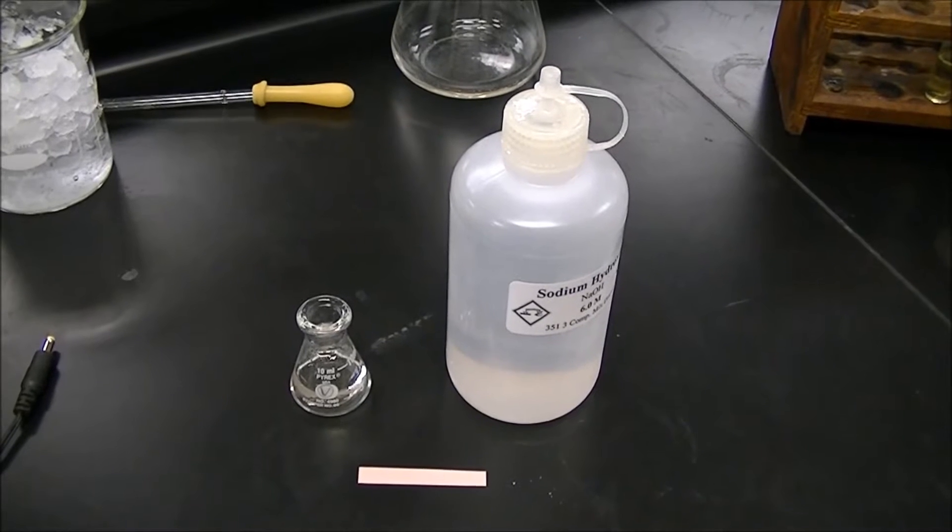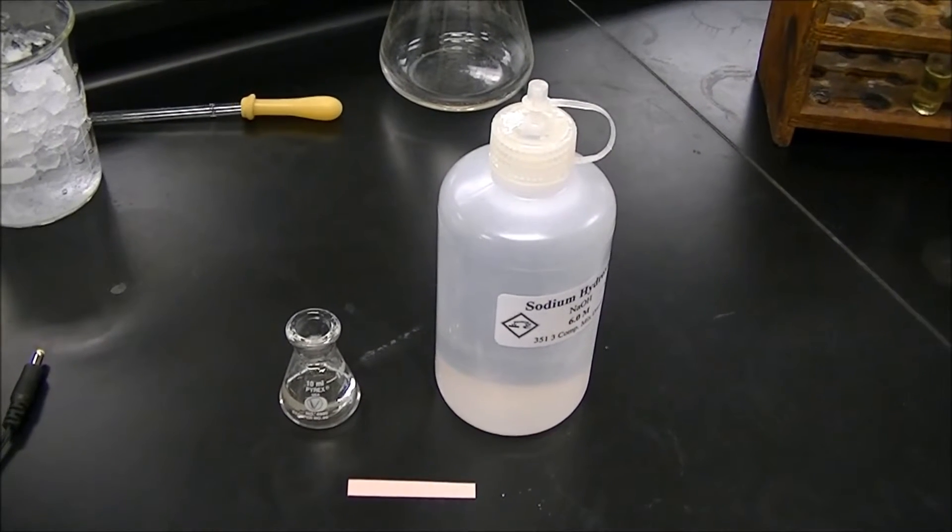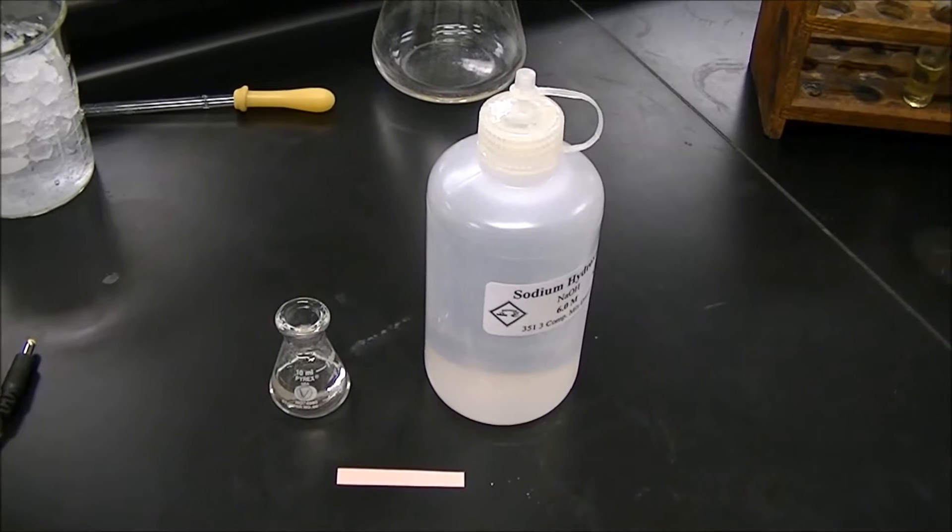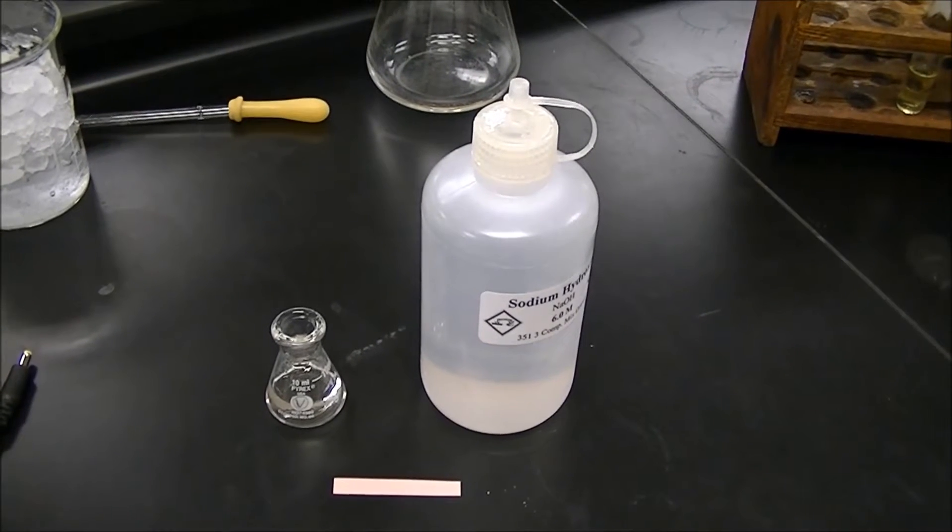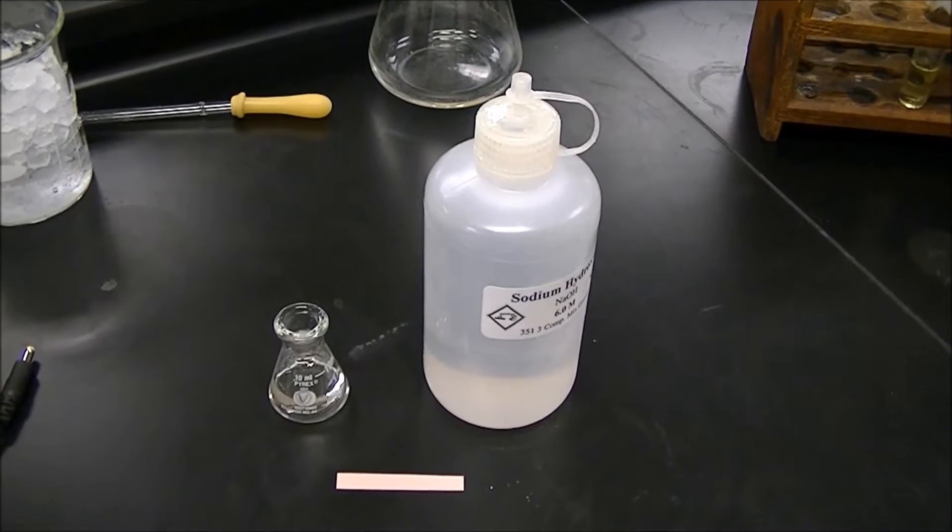Now you'll add your 6-molar NaOH to the solution until the pH is basic. This will deprotonate ethyl-4-aminobenzoate, causing it to be insoluble in water and precipitate to the bottom.